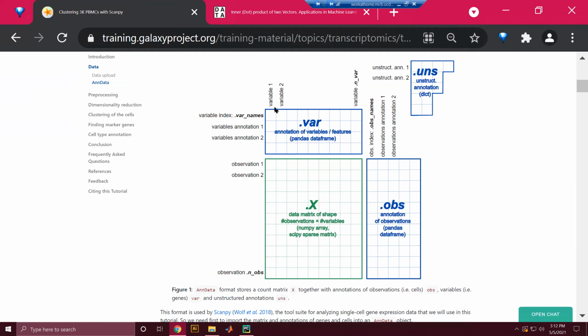If we wanted to sum how many genes were identified within each cell, and we call that total number of genes, that annotation of variables would be accessible if we typed adata.var. That is where we can name annotations of our variables. And in the other dimension, oh, sorry, I got that backwards. Annotations across cells are in .obs, and you can call whatever you named it with adata.obs and then the variable that we named.